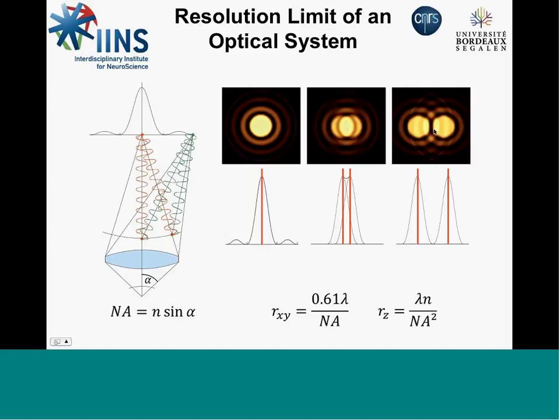So this limit in resolution is a big problem in biology, since you know that most of the interesting organization is between 10 nanometers and 100 nanometers. Most of everything below this 200 nanometers, you will not be able to resolve.